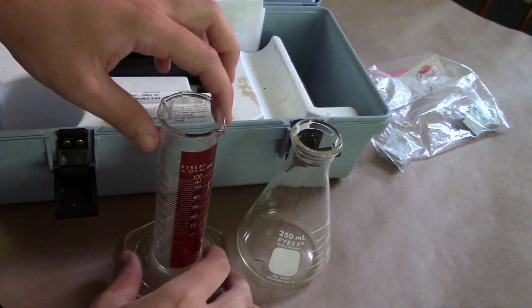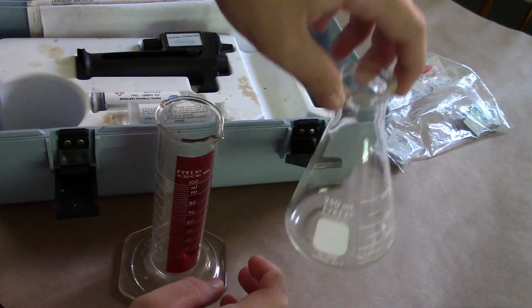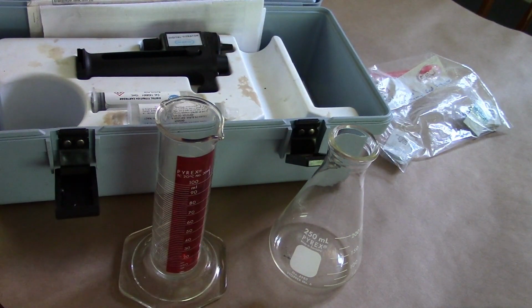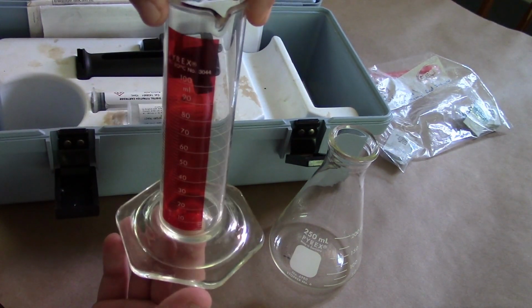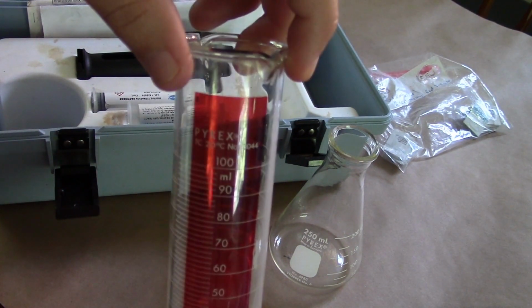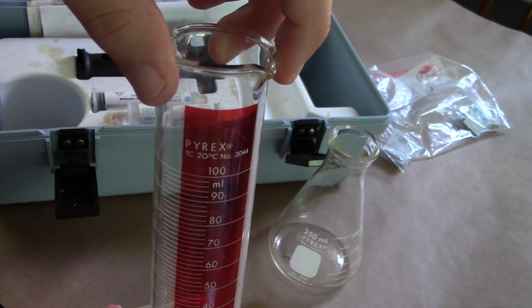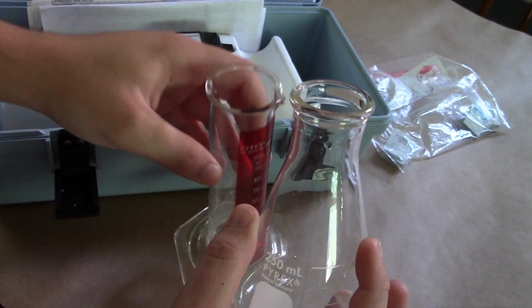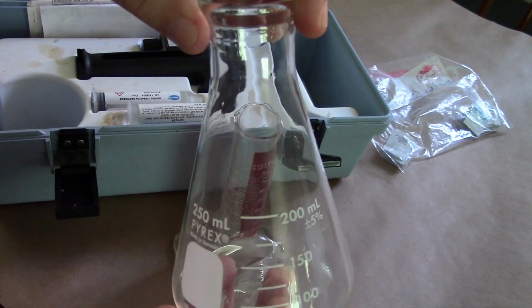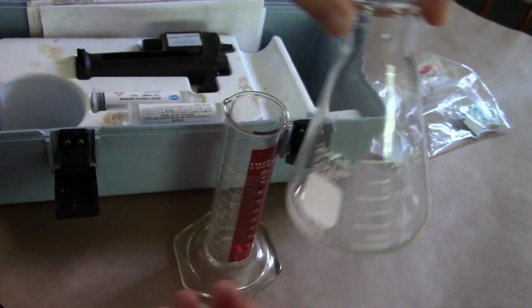The first thing to do on site is to rinse out our graduated cylinder and Erlenmeyer flask 3 times with the creek sample, just to make sure we're not contaminating the test. And then we're going to use the graduated cylinder to measure our sample. We're going to fill this up to the 100 milliliter line, and we're just using the graduated cylinder to do this because it's more accurate. And then we're going to pour that into our Erlenmeyer flask so that we will have exactly 100 milliliters of creek sample in our Erlenmeyer flask.